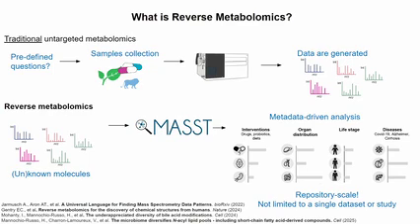So you use MASST, our search tool, that's going to search across all 3 main metabolomics repositories, and then it will retrieve identical or similar MSMS spectra. Then you integrate metadata, and you can ask different questions, for example, different intervention, organ distribution, life stages, disease, and there is much more information embedded into the metadata that you can just explore yourself.